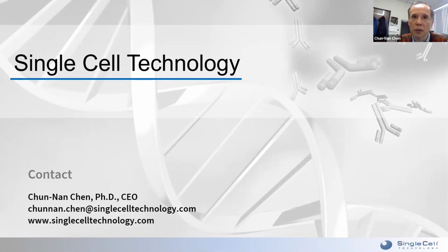And so the idea would be looking at what they have, and with the microscope we have, we can also look at what's being expressed on the surface. So this is again not what we're doing right now, but in the longer term we want to look at T cells for their secretion pattern of the cytokines, as well as what kind of markers are on the surface, and also their paired alpha beta chains for the TCRs. So that's something that we've been thinking about doing, but we haven't done it yet.